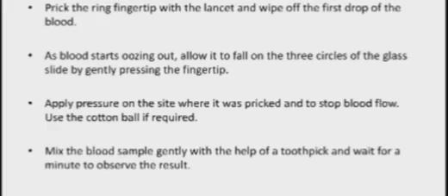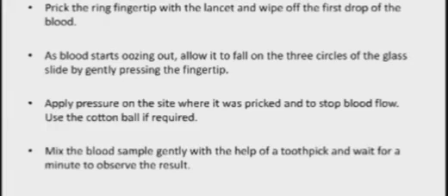Gently mix the sample with the help of a toothpick and wait for a minute to observe the result. You must use three separate toothpicks — one for mixing the solution in A, one for B, and one for D. If you use the same toothpick, there would be mixing and your result will not be observed properly.